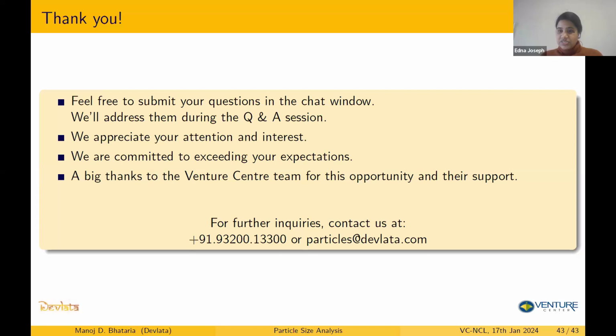Yeah, the first question is from Amit, and he says that there is another technique known as microscopic technique, which they claim to be ideal to measure particle size. Could you please enlighten on the method of using microscope for measuring particle size? As I said in one of the slides, microscope is used for measuring particle size.